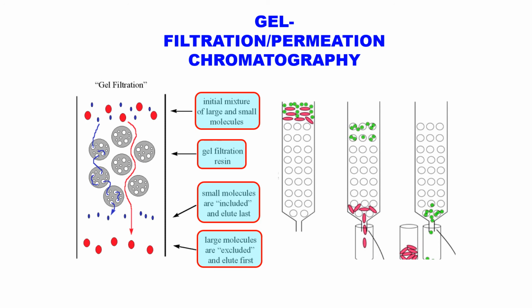Gel filtration finds its most common application in determining the molecular mass of a protein, as an unknown sample is run against a standard solution of known sizes.